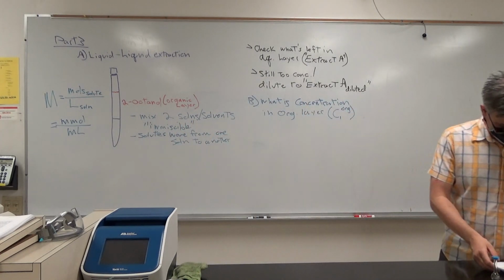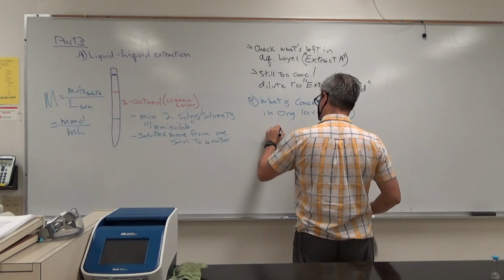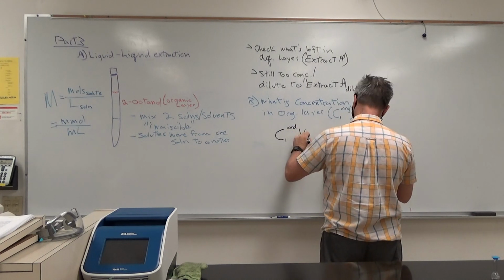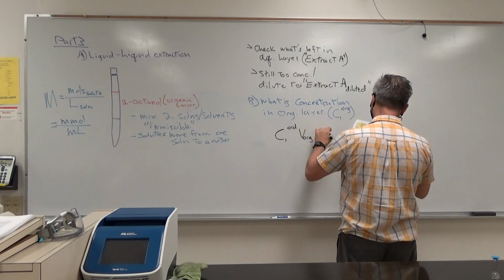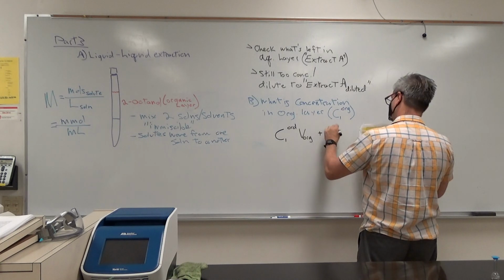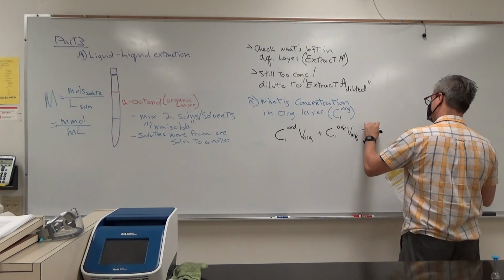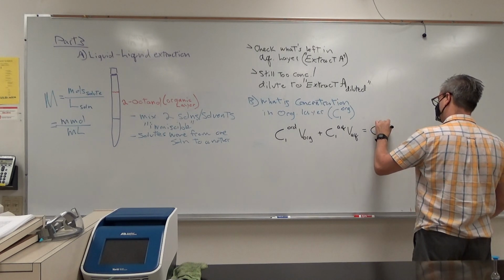The way the math works out for that is C1 org, and this is all in your procedure as well, these equations, V org plus C1 aqueous V aqueous equals C naught, that's a naught symbol, aqueous.